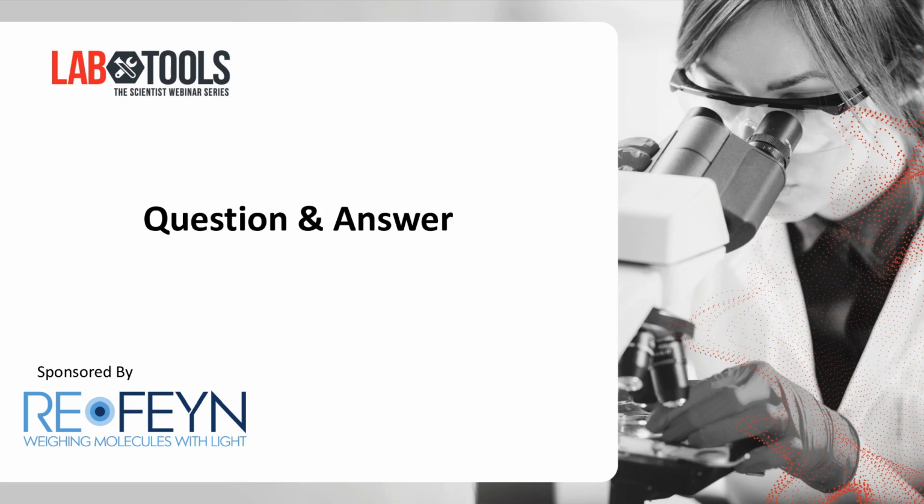Dr. Yin, a first question. You talked about the difference in stoichiometry for Fabs versus full antibodies binding to an antigen. I was wondering if you would expect to find a different binding ability of an antibody to a spike protein if you would be able to model the entire viral surface where you have multiple spike proteins present. Yeah, that's a really good question, and we've been discussing that as well.